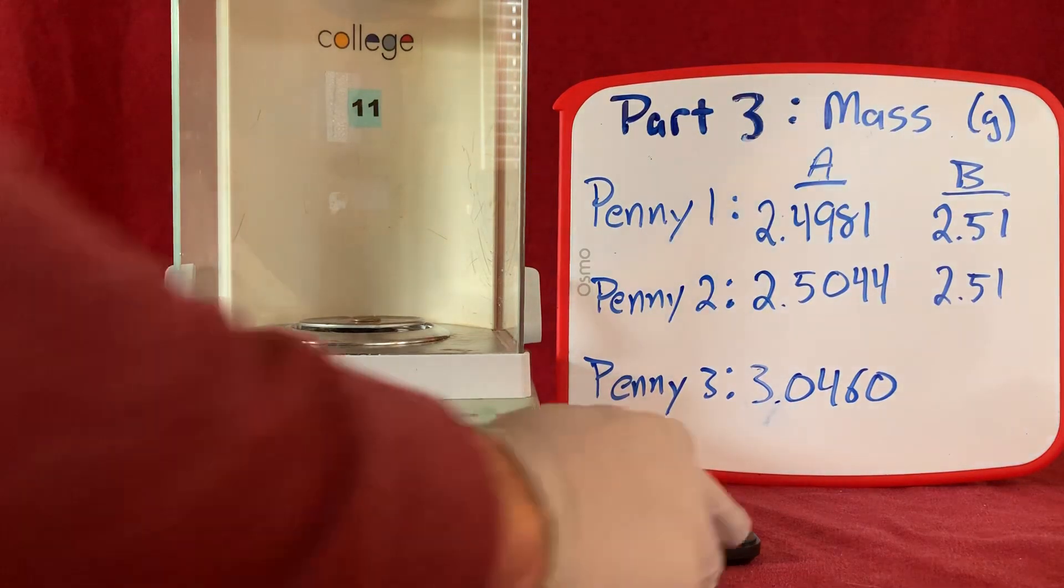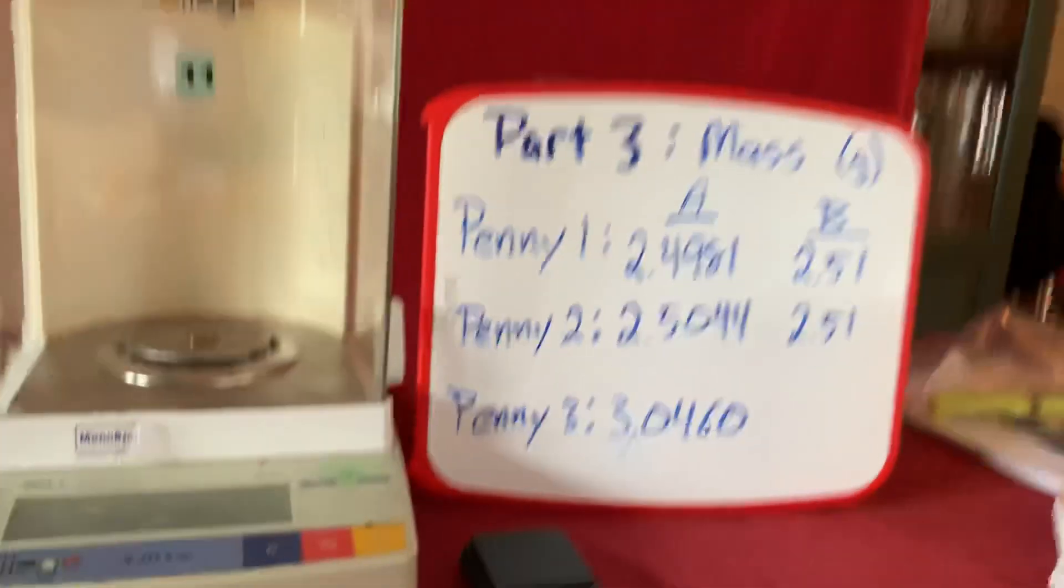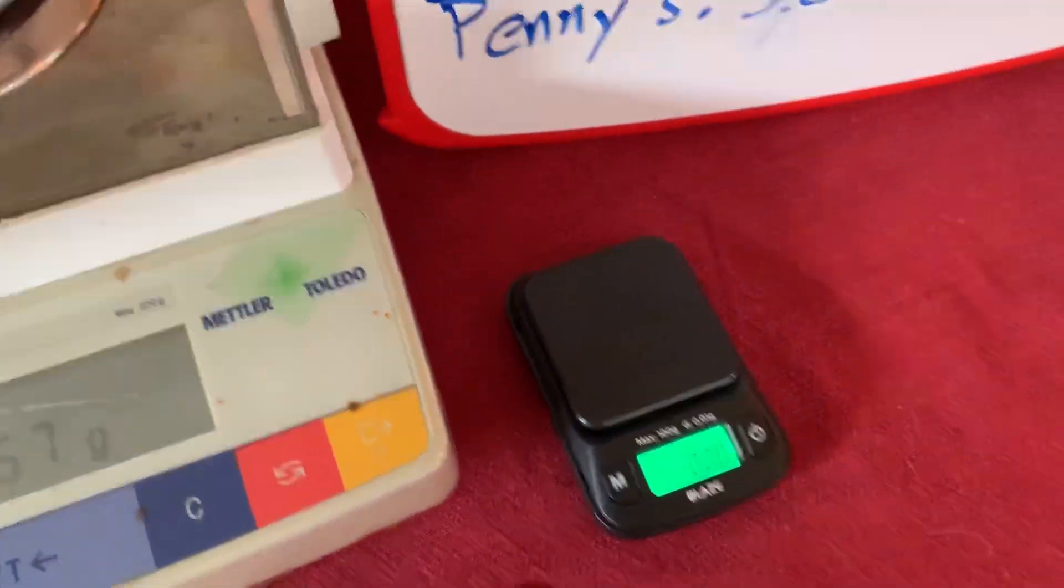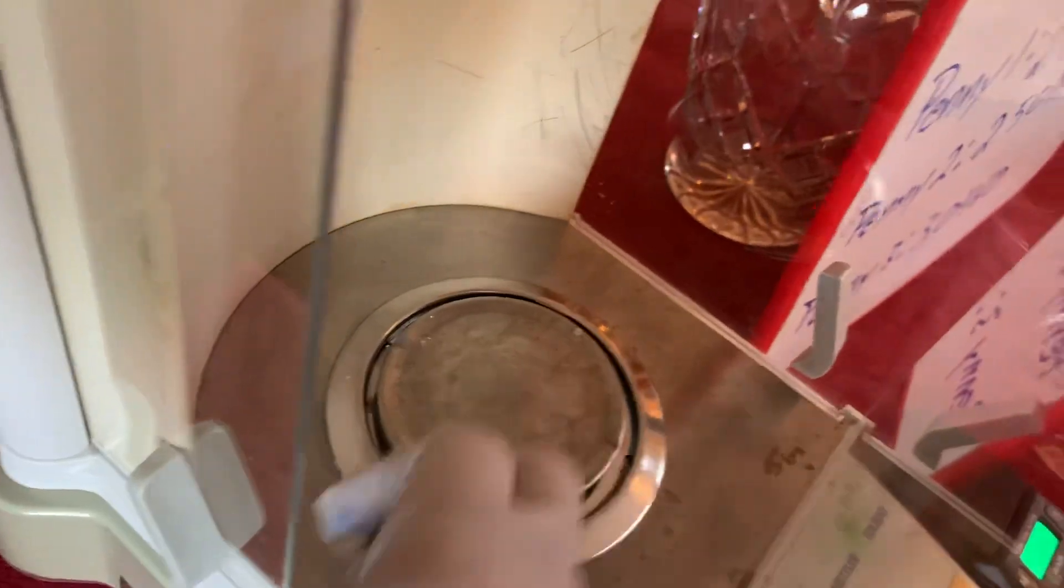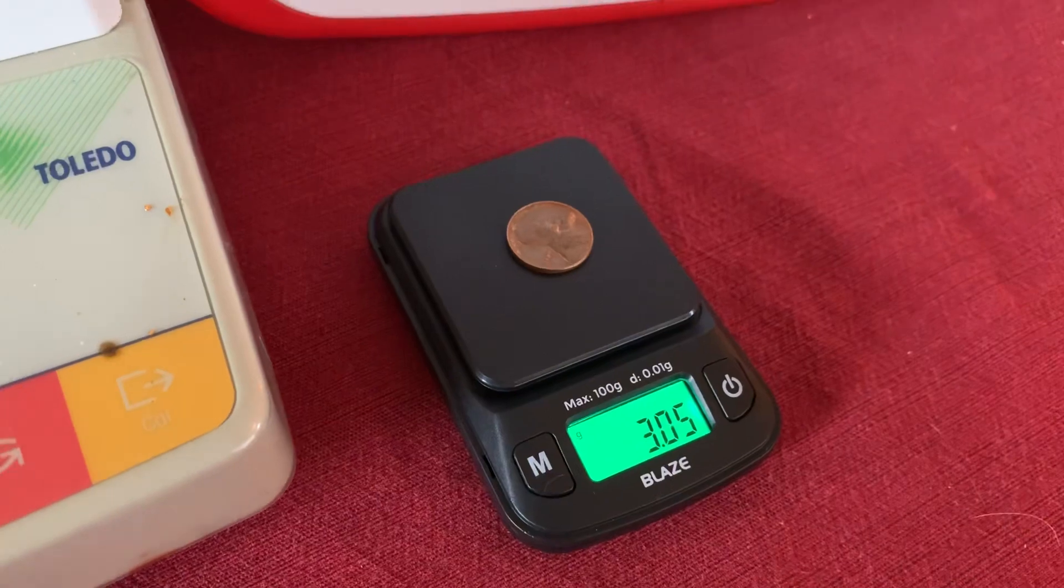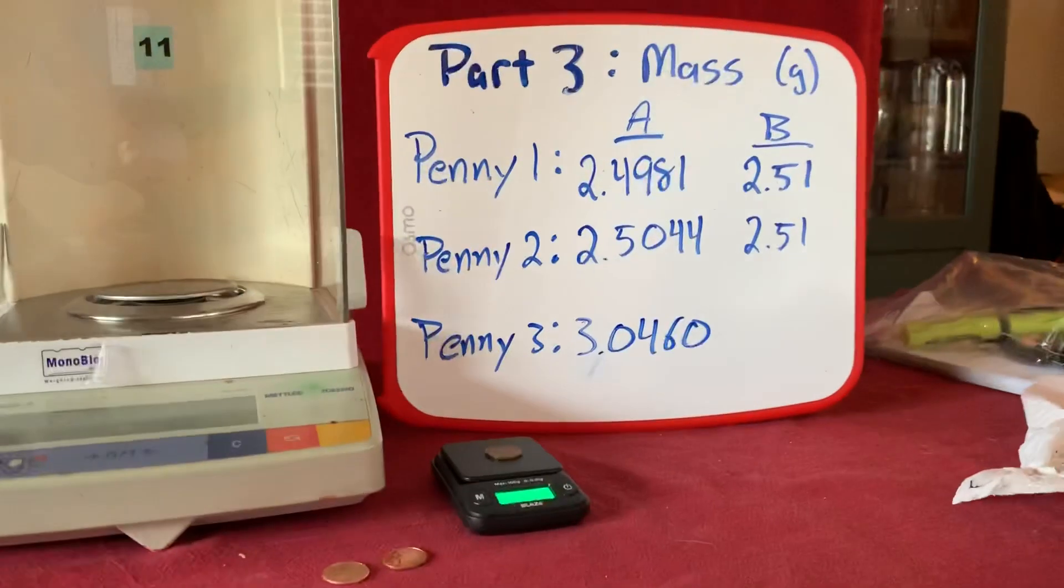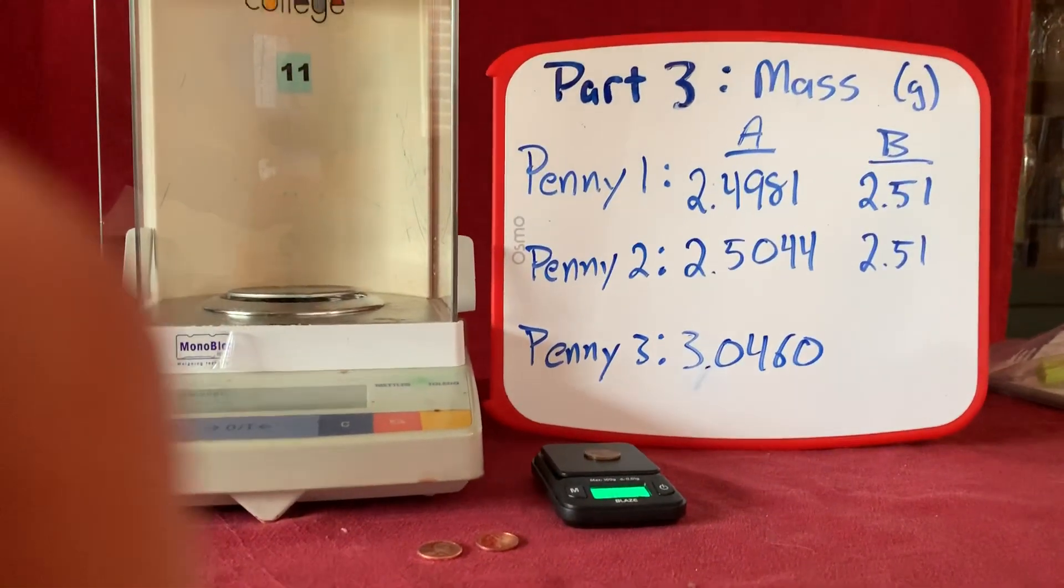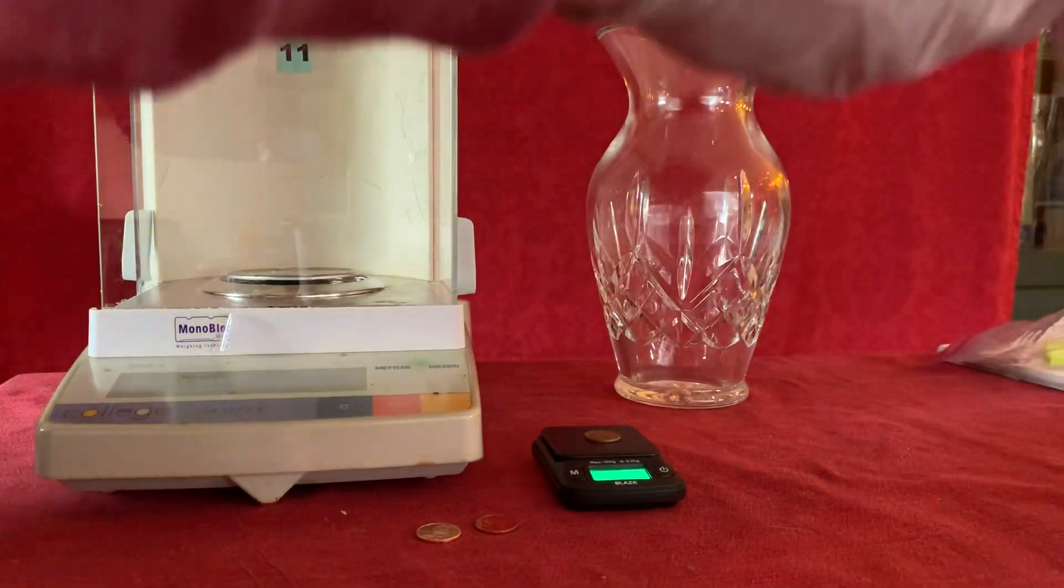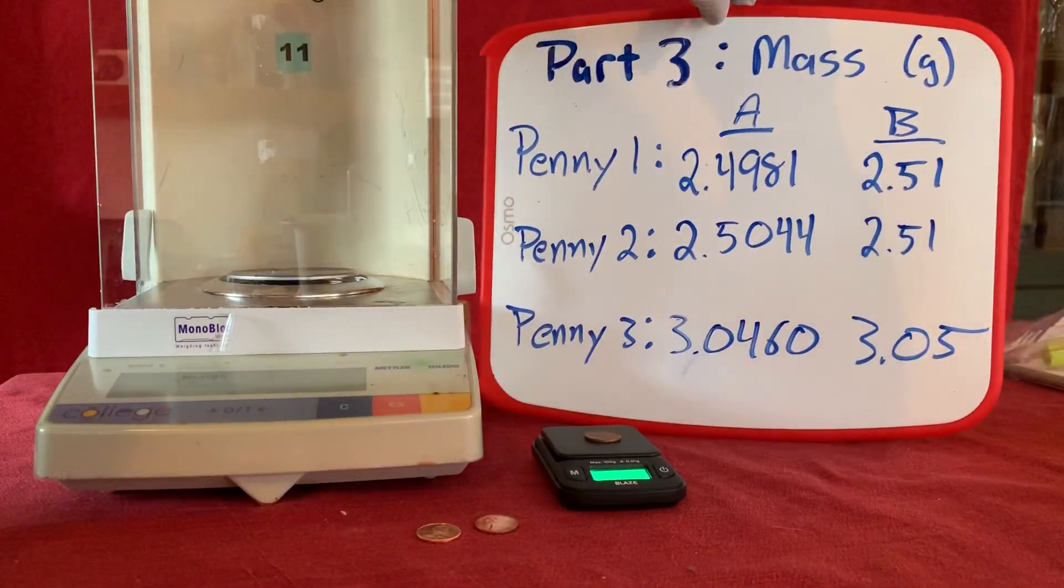Let's take the same measurement on our home balance. I'm going to turn that on. You can see now that that is already tared to zero. Let's put that penny on there. Put it on our home balance, and we see that we have a measurement of 3.05. Notice here we only have two places past the decimal point on this balance. It's because these two instruments have different precisions. 3.05 grams.